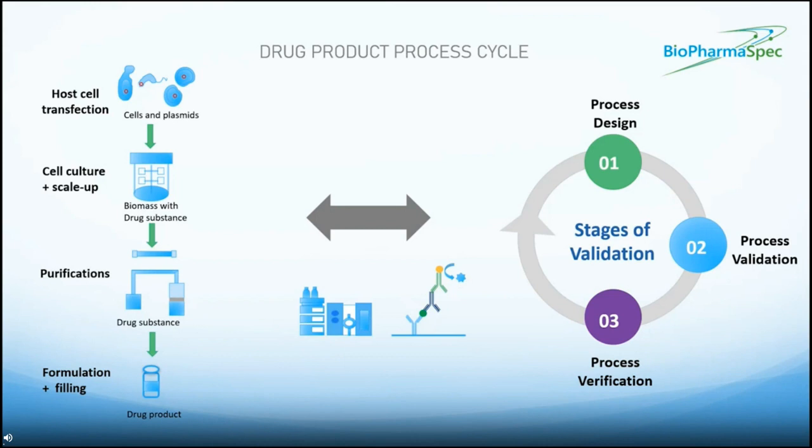So why are we monitoring for host cell proteins? Most of us, I think, are aware now of the need to monitor the host cell protein population in a biopharmaceutical drug substance. It involves multi-step purification procedures that polish most but not all impurities out of the final product. And manufacturers need to determine which and how many HCPs are present, and to know that the safety limits are product specific and defined on an individual basis.